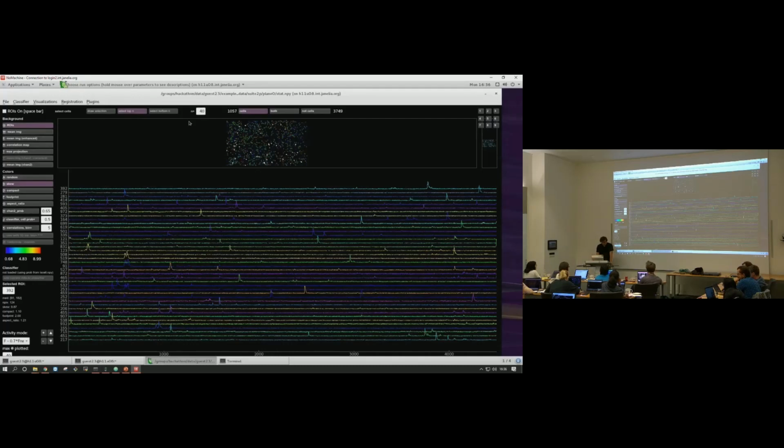And then if we take the bottom 40, now let's see. Right, so these are going to be the ones that look least like they have transients. Now, for these cells that are relatively not skewed, it could be one of two things, right? Either they have a lot of activity, but it's kind of going on all the time, or they don't really, and they represent mostly kind of like the neuropil.